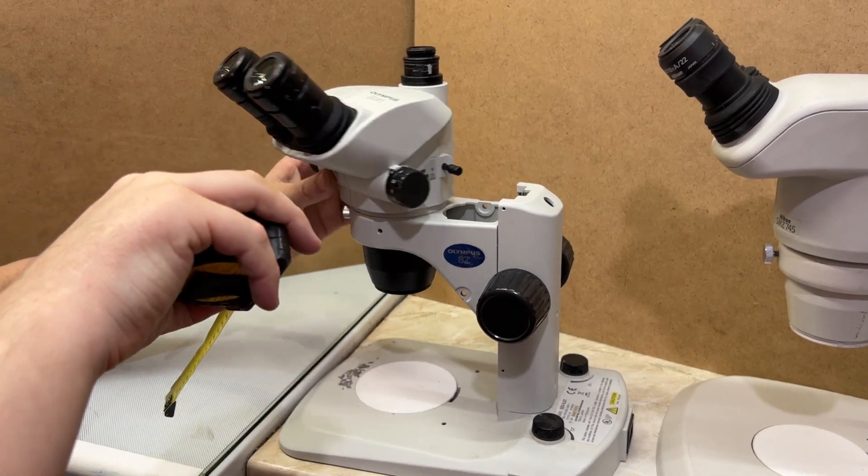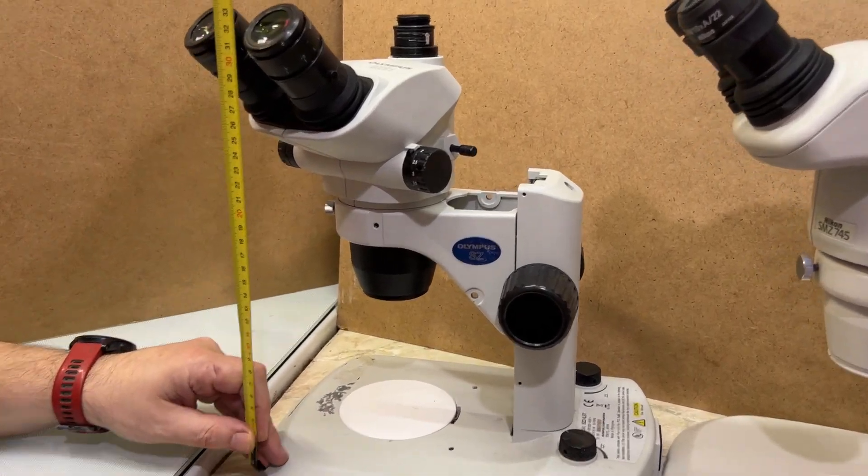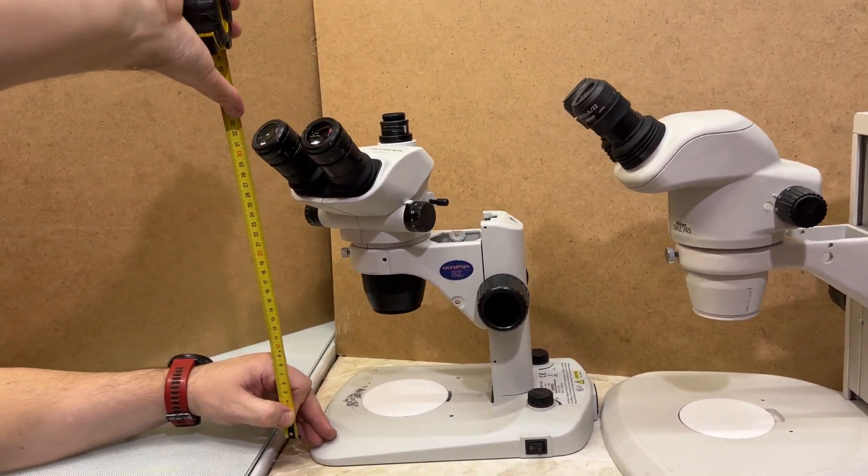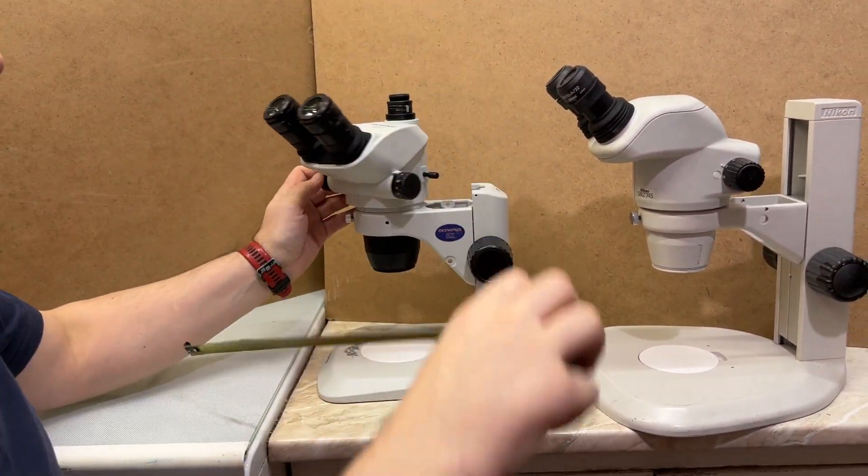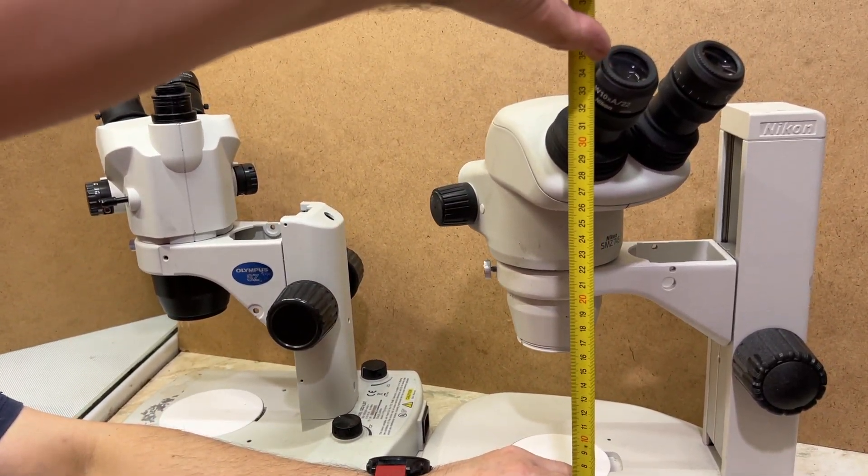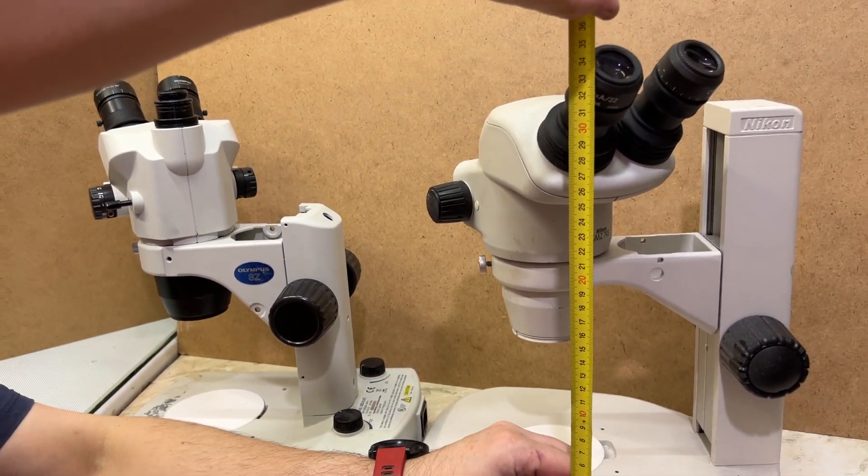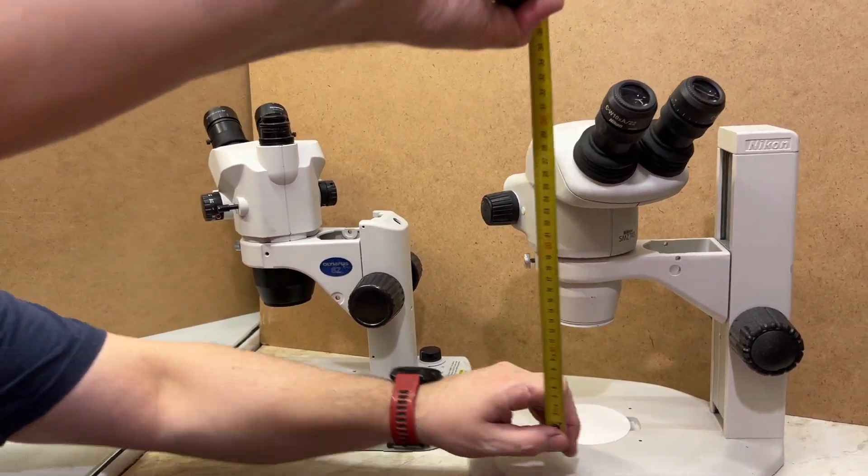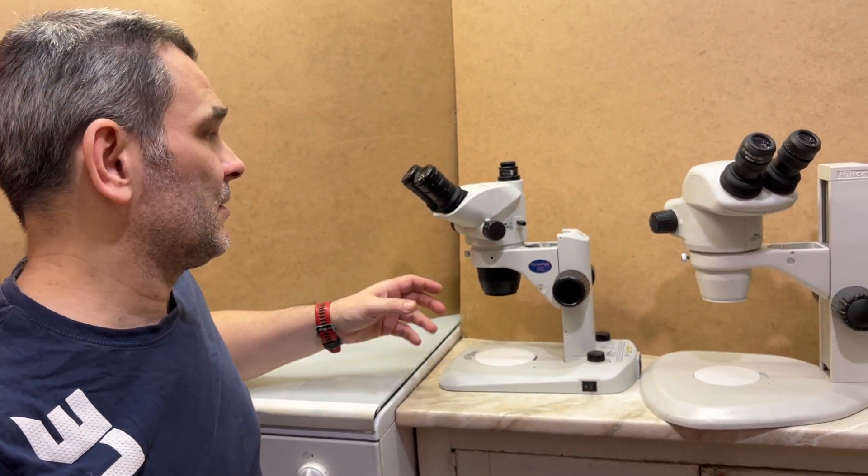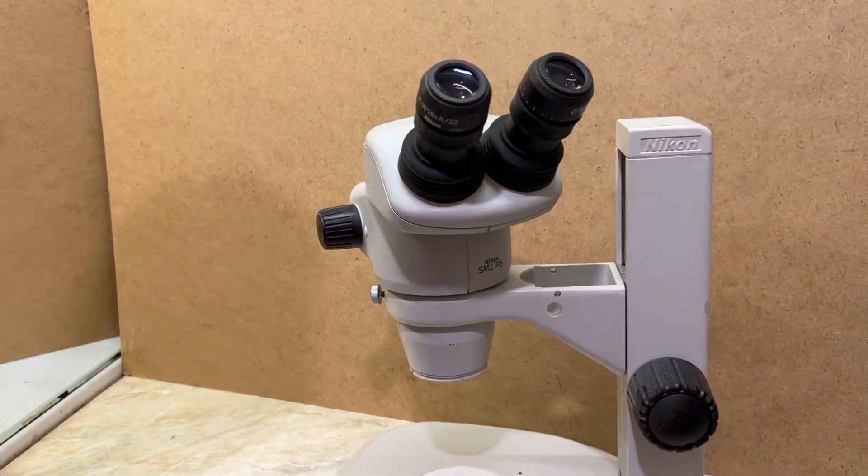If we look at the Olympus and measure the distance from the top length to the working space, we have about 32 centimeters. If we compare that to the Nikon, we can see about 34 and a half centimeters distance from the working plane to eyepieces. These two microscopes are not that high but not that short positioned either.